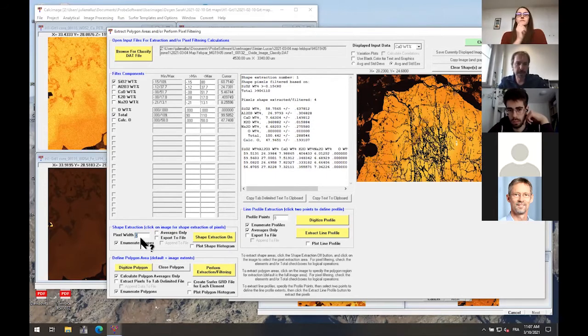But as soon as I increase the number of pixels, like 20 by 20, this will be 400 pixels. If I get my average, I get gorgeous results. With that, I get the precision of a point analysis. The only downside of this approach, of course, is that if you were to select the points like here, you are at the zone where the calcium is changing. So by averaging too much, you will start losing the primary information, which is the spatial information. Okay, perfect. Thank you. Does it answer your question? Yeah, thank you.